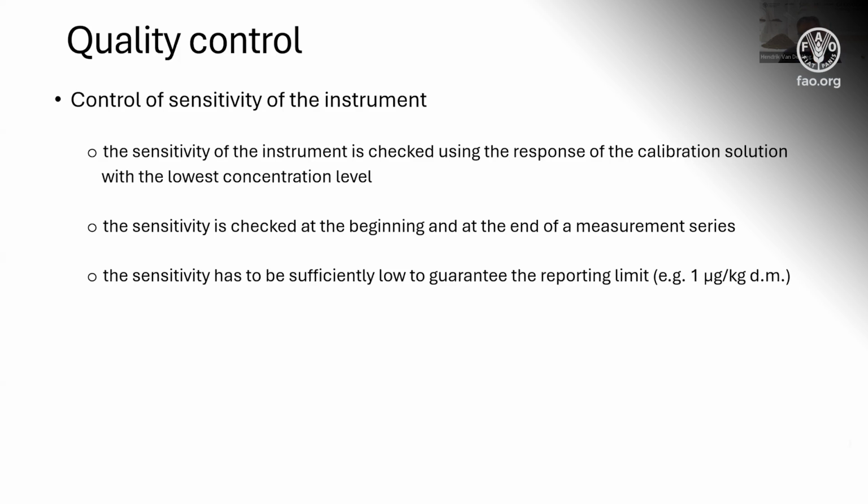Well, let's say that in general, these interlaboratory reproducibilities are lower than 30%. Sometimes as good as 8, 9, 10%. And on the basis of this reproducibility, the Z-score of your laboratory is calculated, and you can see how well you performed in relation to the other laboratories.